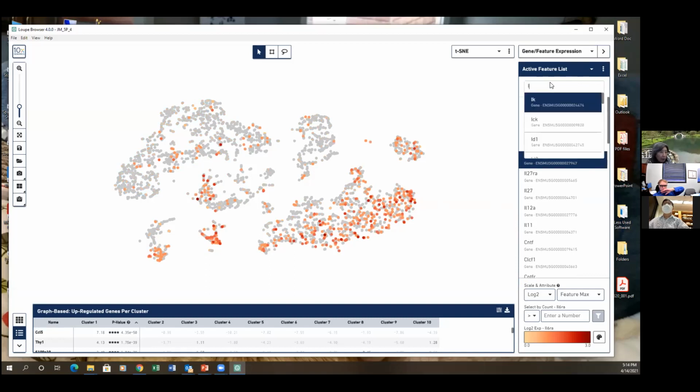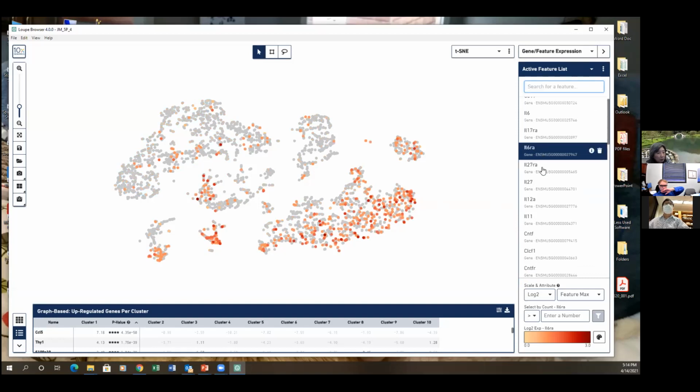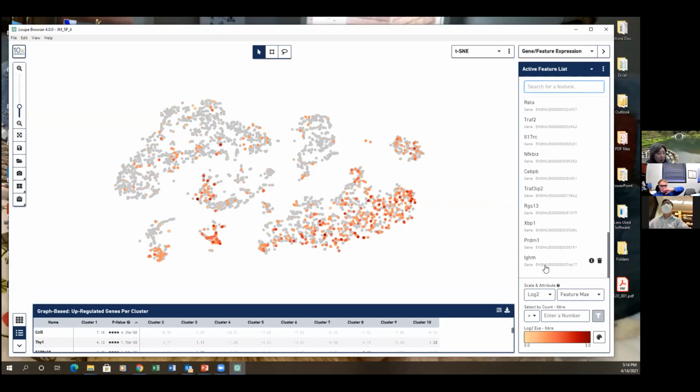Let me see IgHM, this is earlier germinal center B cell, where are they? It's still around here, and some still over. It's even in the T cell zone. I think this area, especially here, light zone, there's some early germinal center B cell too.